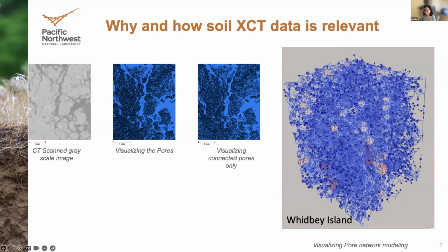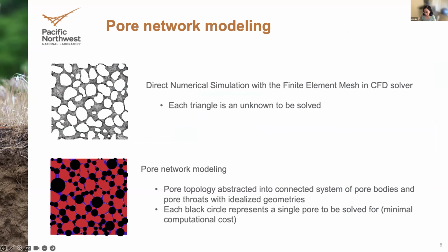This is the kind of information I use from XCT. So coming back to think about pore network, what it means for pore network modeling. I don't know if maybe Brian may talk about this, about CFD kind of solver, a more realistic numerical representation of the pore network that we have to solve for flow and transport. I think about it in a simple way, right?